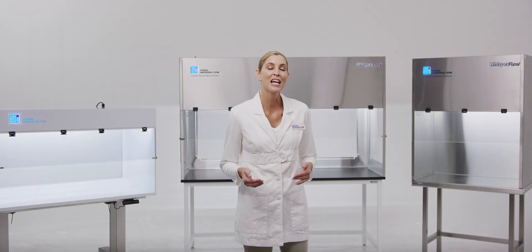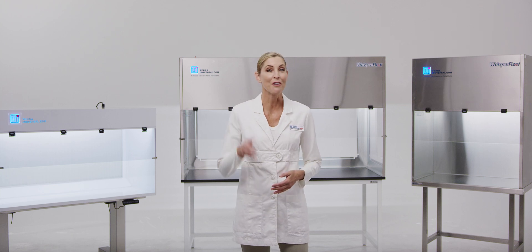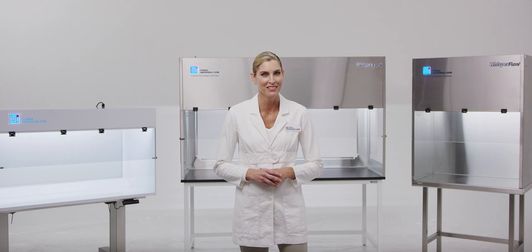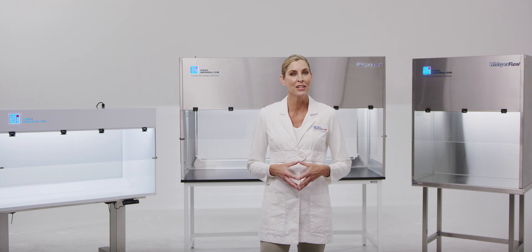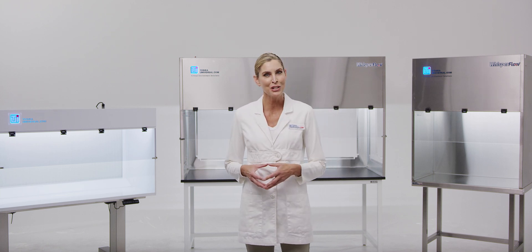In summary, Terra's WhisperFlow Benchtop Laminar Flow Hoods are UL listed, rated for 5 years of continuous operation, and stocked for immediate shipment. For more information, please call Terra's technical sales staff at 714-578-6100 or visit our website at TerraUniversal.com.